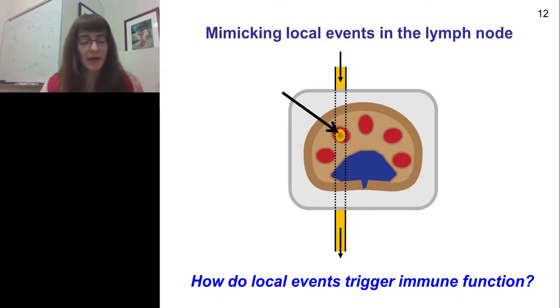You can imagine that pipetting here is quite difficult, especially when this is in a bath of media. And we didn't want to insert any microneedles into the tissue, as that may damage it and cause there to be a reaction that changes the response. So we took a cue from some prior work out of David Eddington's lab at the University of Illinois at Chicago, where he had laid a microfluidic channel beneath a chamber holding a brain slice, and then used ports to deliver to just one part of the brain tissue, as illustrated here.